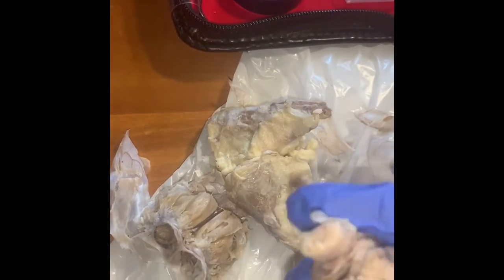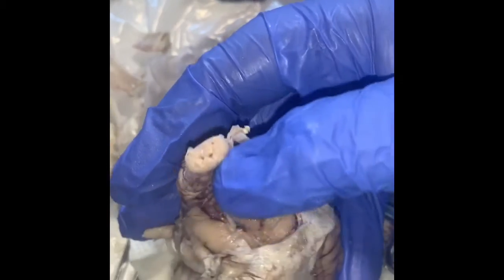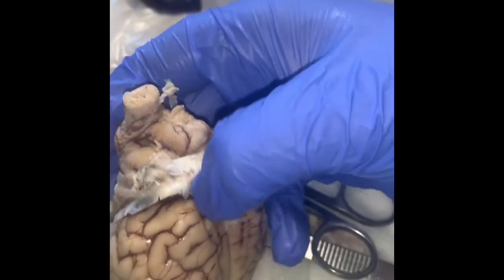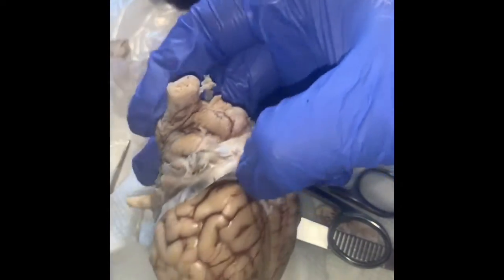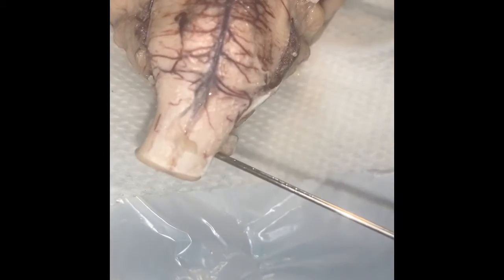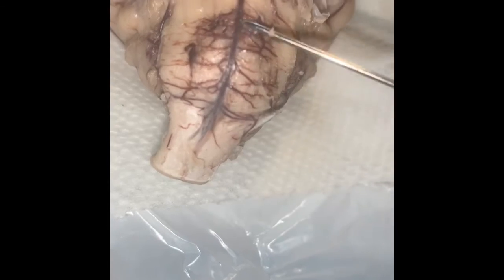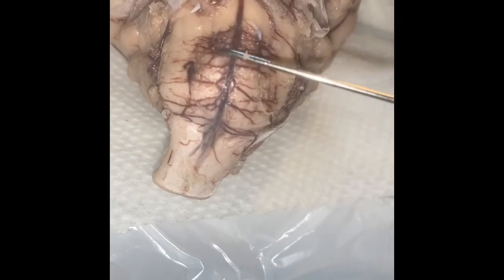The back part, back here, kind of where it disconnects, that is the cerebellum, right back here. This is the spinal cord. Okay, just down by the brainstem now. So this is the brainstem, and then this is the medulla oblongata, and then right up in here is the pons.